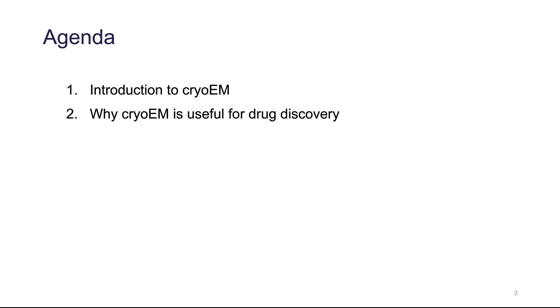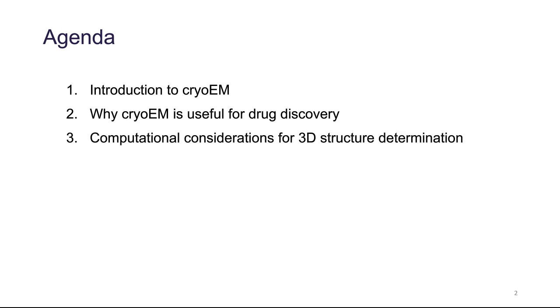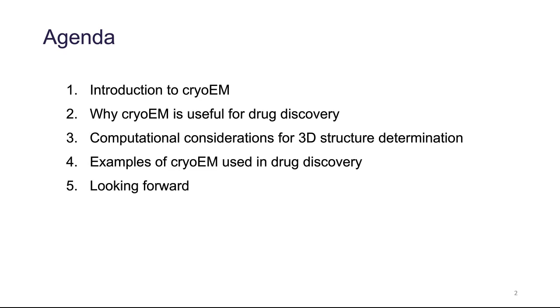I'll start by giving an introduction to the CryoEM method, which of course may be review for some of the audience. Next, Jakob will explain why CryoEM is useful for drug discovery and what role it is expected to play. I will then get into a bit of detail about the computational phase of 3D structure determination, highlighting the key concepts, pitfalls, etc. Jakob will provide some examples and details about how these tools are already being exploited in drug discovery today, and I'll end by talking about some of the exciting advancements that are happening now, as well as ideas for the future.